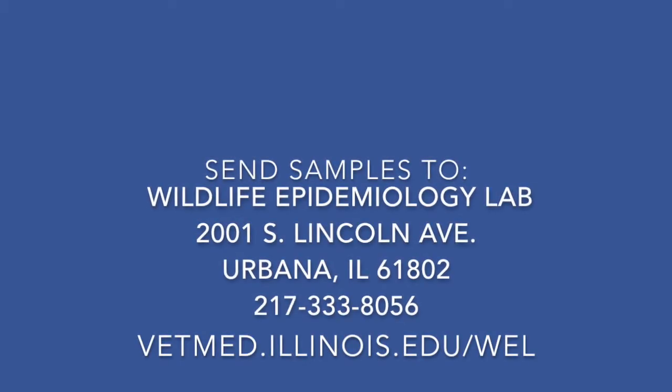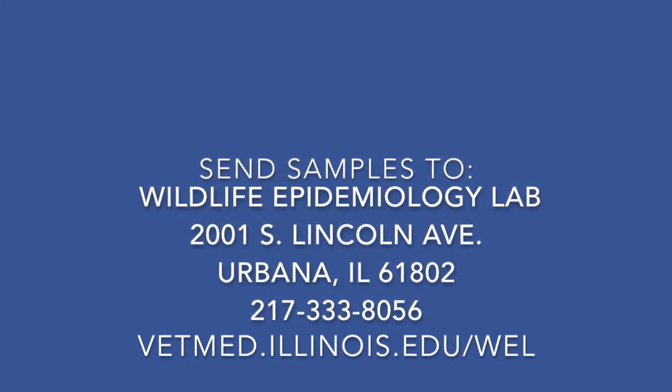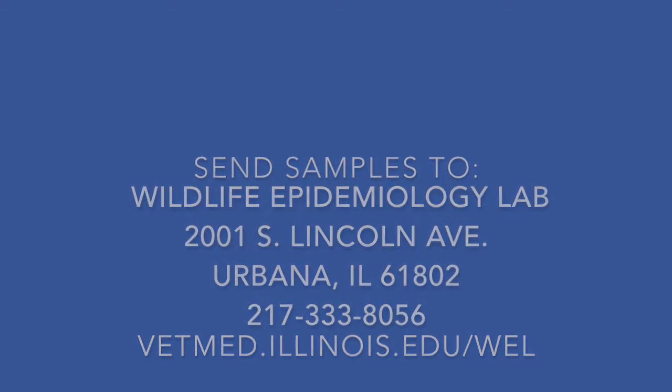Sample boxes should be shipped in the provided styrofoam cooler with the frozen ice pack via overnight shipping. Data sheets should be included with the shipment and should be placed in a sealed plastic bag for protection.